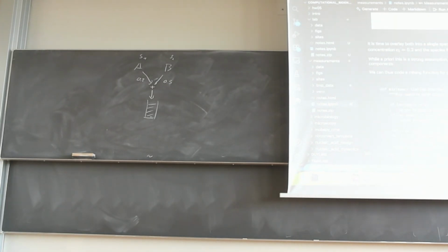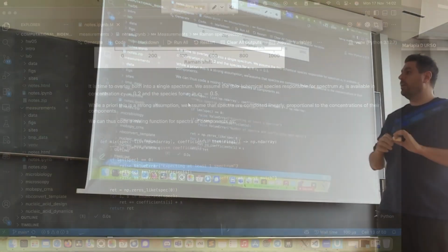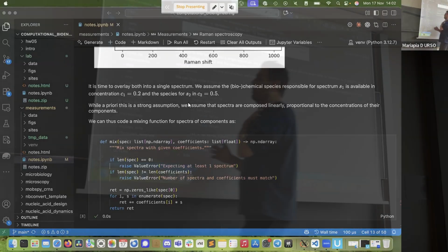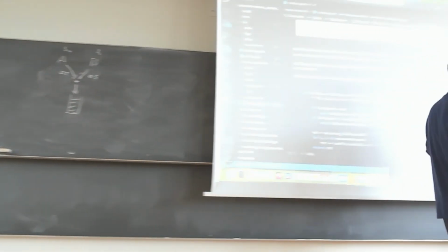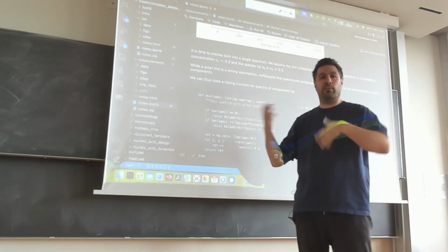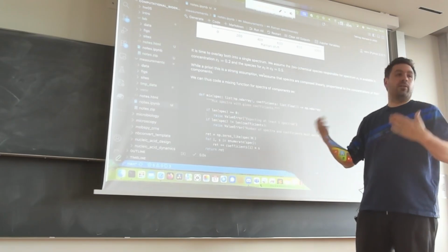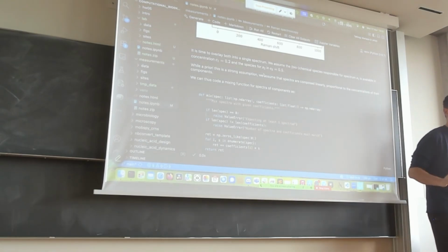And what is the spectrum doing? There are quite nice properties, of course, also in some limits only. But roughly, what the spectrum is doing, it is adding up. So if you have this spectrum and this spectrum, you are getting the added spectrum here. This is because you will now have both bonds in the given concentrations that you inserted, and they are both creating these scattering effects that you will measure. So the spectrum is additive here.